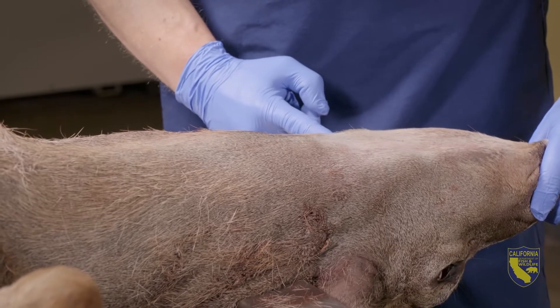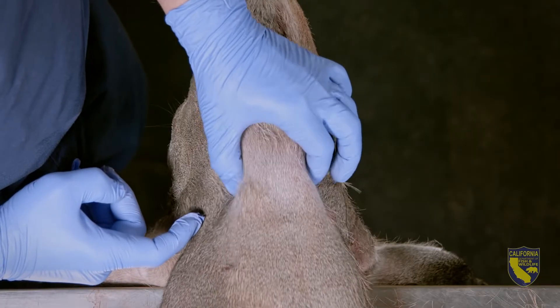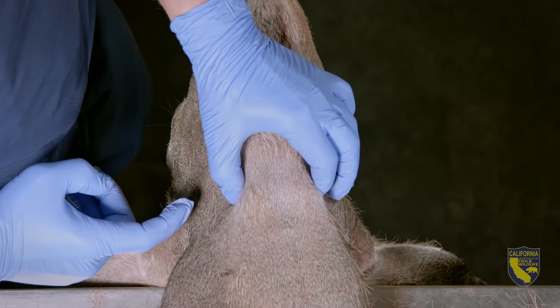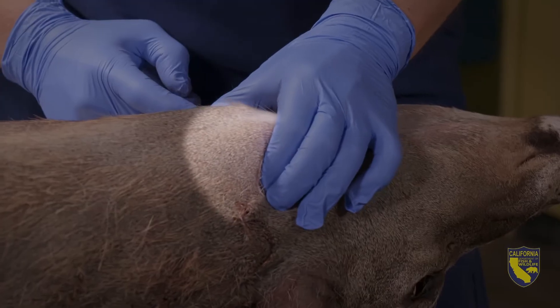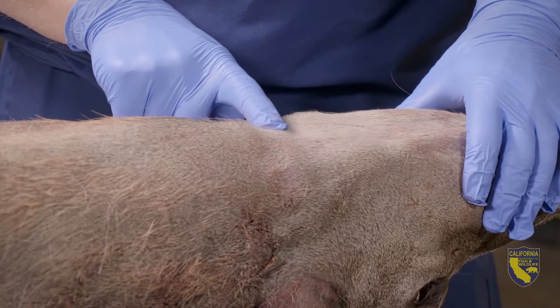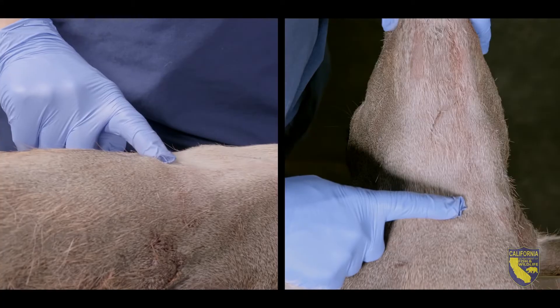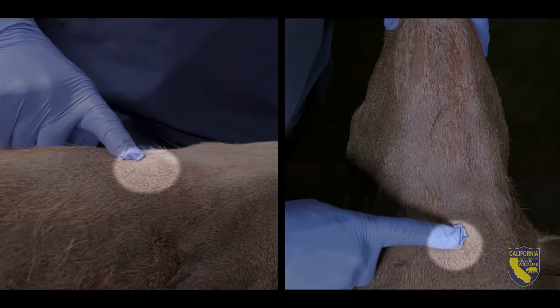First, you need to find the end of the jawbone. At the end of the jawbone, right here, you can feel the trachea. Find the widest part of the trachea. This is the larynx, and it should start about where the jawbone ends. You can also find it by running your finger down the underside of the neck along the midline. Once you pass that last bump, you're at the end of the larynx.